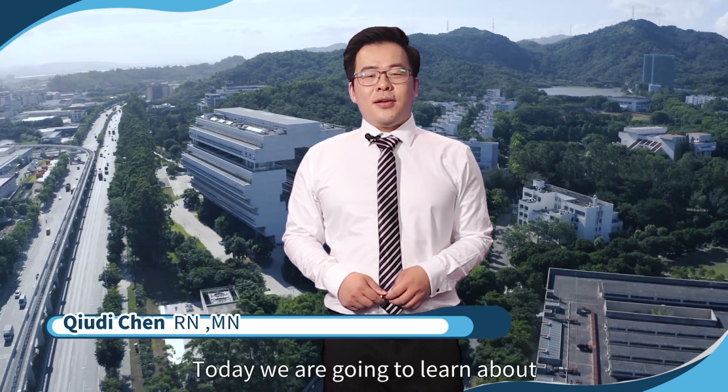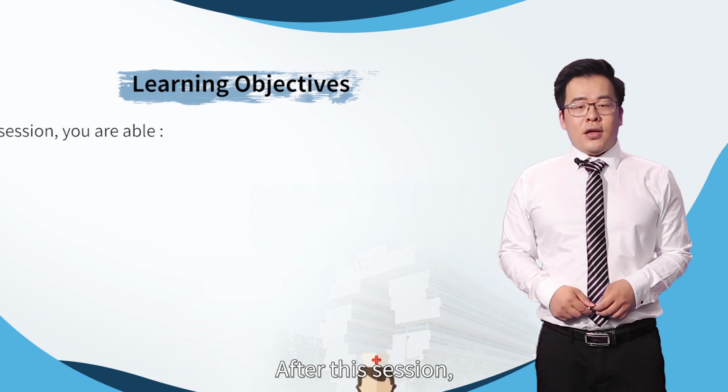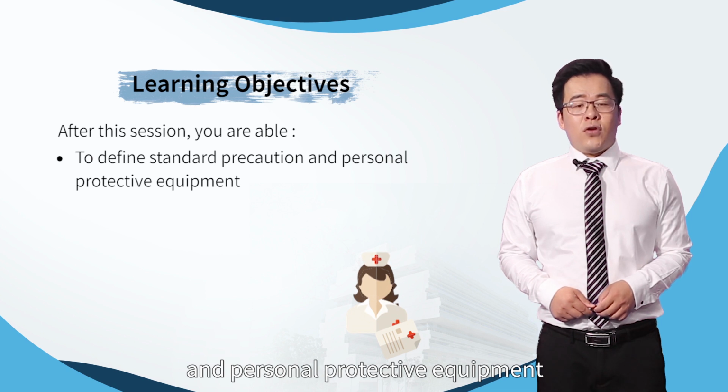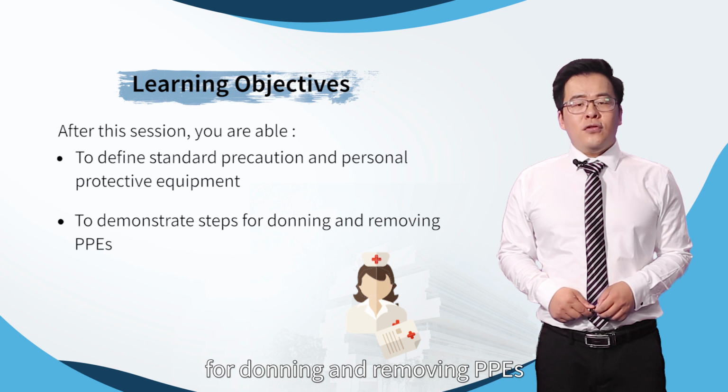Today we are going to learn about applying and removing personal protective equipment. After this session, you will be able to, first, define standard precautions and personal protective equipment. Second, demonstrate the steps for donning and removing PPE.